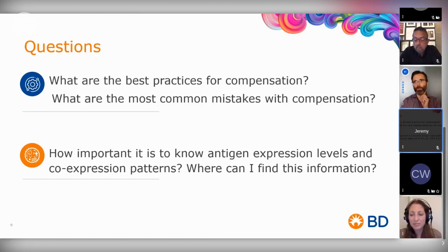It's so common for people. Well, it's obvious if you have GFP. Some people can't have just a cell line expressing GFP, for instance, so they don't have that single stain control, and they'll use FITC, just because it's green. This is not so common anymore. People realize that they need to use something similar. But here's the problem: we don't want something similar. We want the exact same fluorochrome, and I'm repeating this on purpose because that's the most important aspect.